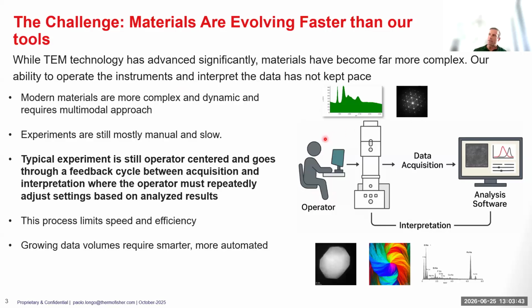But the way we run the experiment, for the most part, is still very old style. You're the operator, you're sitting here, you set up the microscope, you take data. You have a lot of different techniques now, and the hardware is very powerful, very sensitive, very fast, so you can generate a lot of data at the same time.